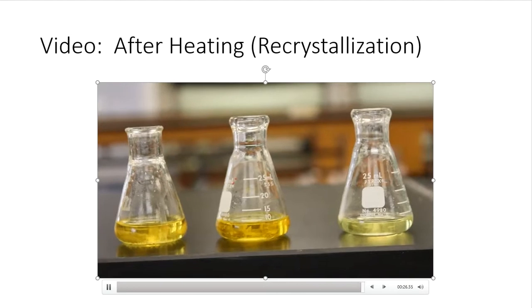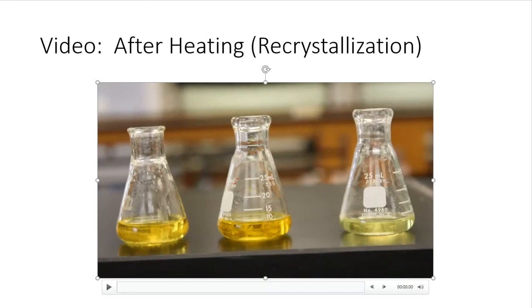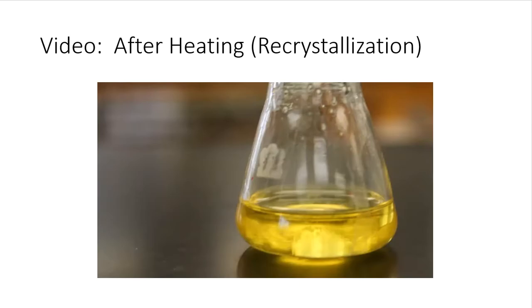I cannot tell you how many times I have to repeat myself, right? And the reason that I repeat myself, folks, is because these are the things that have happened in the lab before. People will read, do a recrystallization from 95% ethanol, and they just squirt ethanol in it and call it a day. No, you just added alcohol. That's all that you've done. You've not recrystallized anything. Nothing. Zero. So we've got to make sure that we dissolve it, and then we have to make sure that we precipitate it back out, or allow that crystal to fall back out of solution.